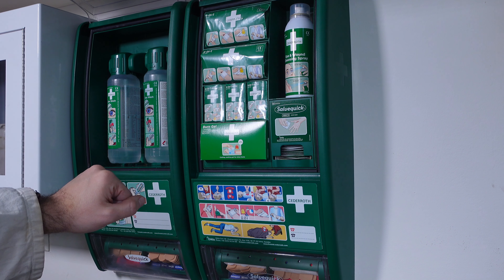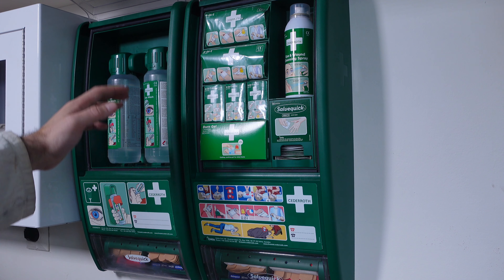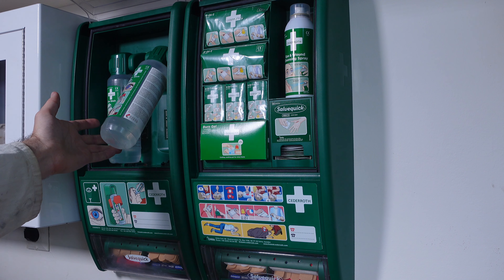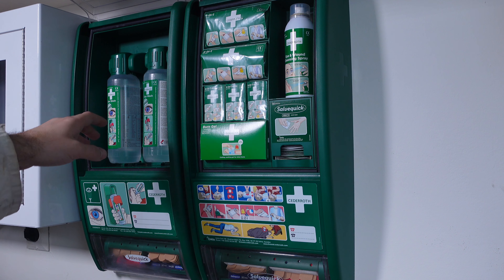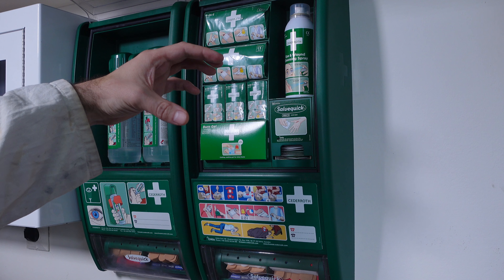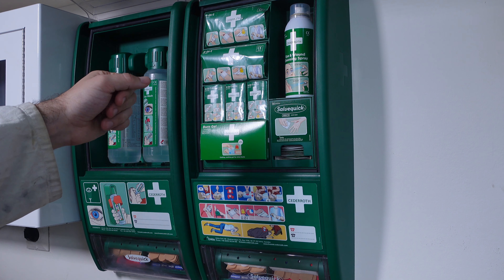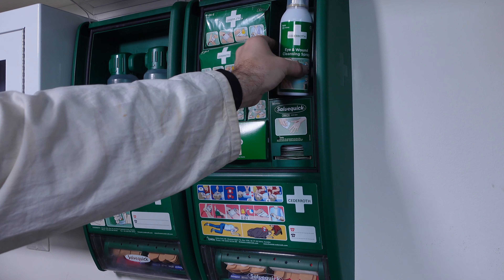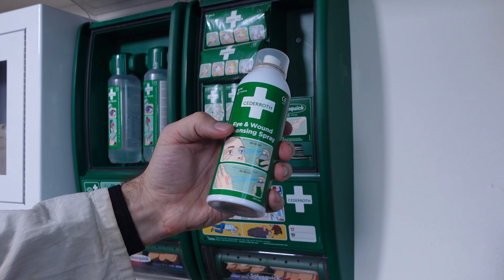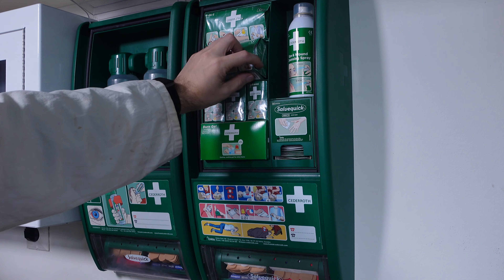Each station is under a plexiglass so all the content is protected, and we've got a wide spread of different items. Since it is a lab environment, the most important part is the eye wash — those are saline bottles with a special attachment that you can press onto your eye and squeeze to remove any contamination. We also have a spray that can be used in your eye or to clean a wound; it's a saline solution.